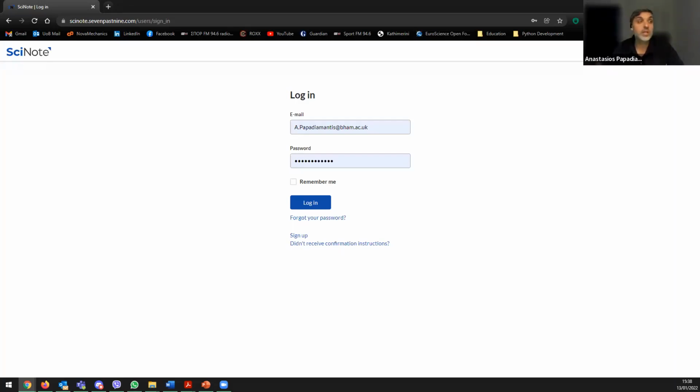If something is locked within an account, then it's meant for some reason to be accessed through that account, in which case you would need an account to access all that's stored inside. If you export it in the form that we said, then you can access it at any time as you wish. Any other question? I hope I answered your question, by the way, Ralph.